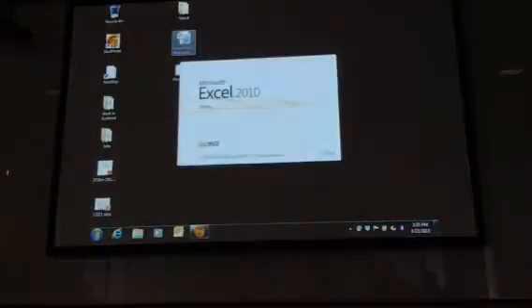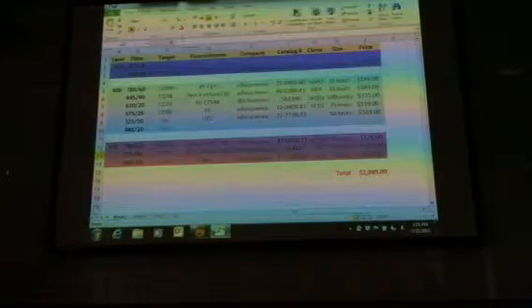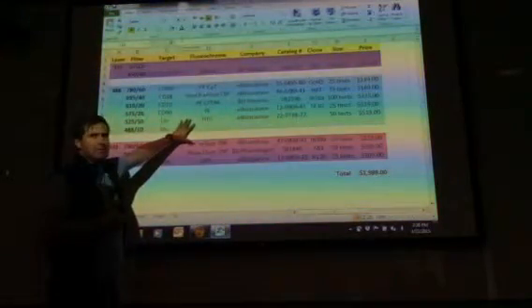So, does everybody remember all about the filter sets and the lasers and everything like that? Okay, the other class, nobody had a clue. So to try and make it a little bit simpler, this is just the Excel spreadsheet that I used when we were setting up this experiment. It was the easy way of showing, according to the laser and the filter right here, the different things that we use to detect it, and then this is the fluorochrome or the colors that we use.